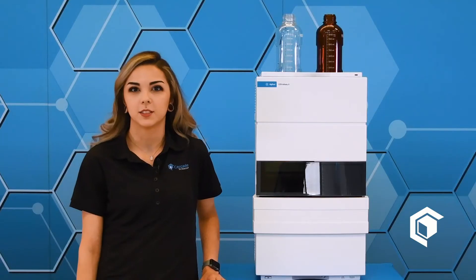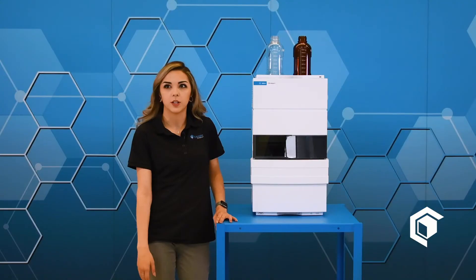Cascade Sciences offers a complete turnkey solution. It's designed to test 11 of the most commonly targeted cannabinoids. You're able to test products from flour, concentrate edibles, as well as refined isolate.